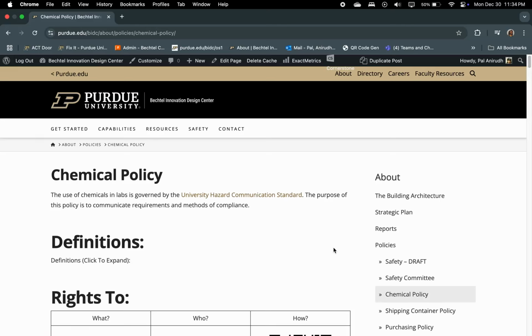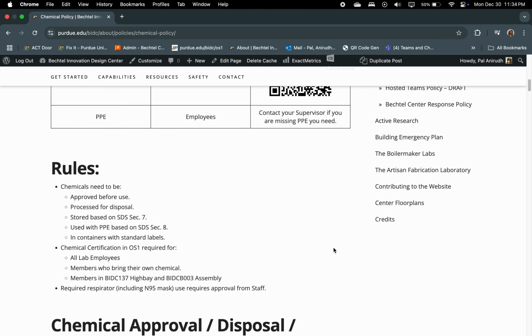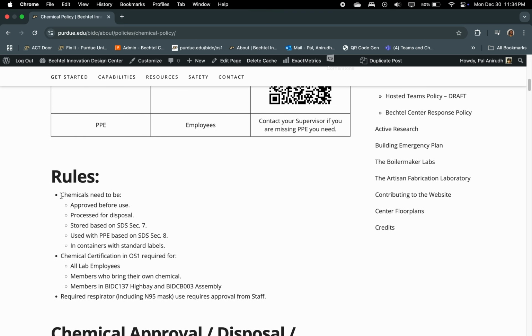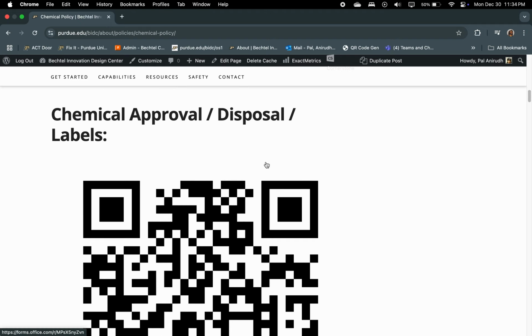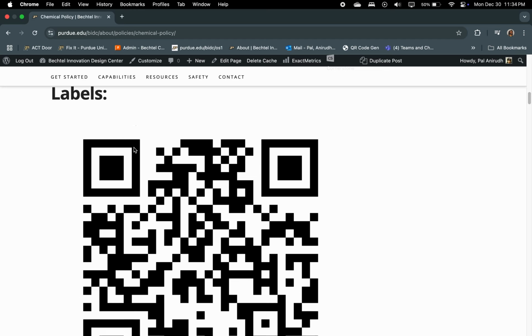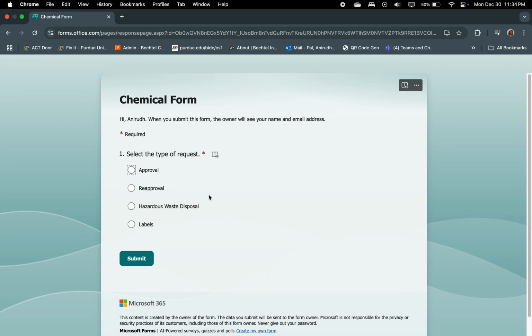In this video, I'm going to cover how to file a chemical approval for the Bechtel Center Chemical Policy. If you're certified under the policy, you must be aware that for you to use any new chemical, you need to achieve an approval first. To get the approval, the first thing you need to do is file our chemical approval / disposal / labels form. You can scan the QR code or just click it and it should navigate you to the chemical form.